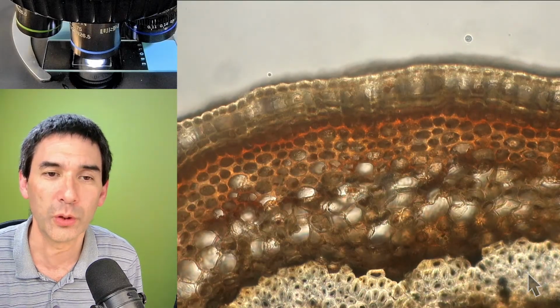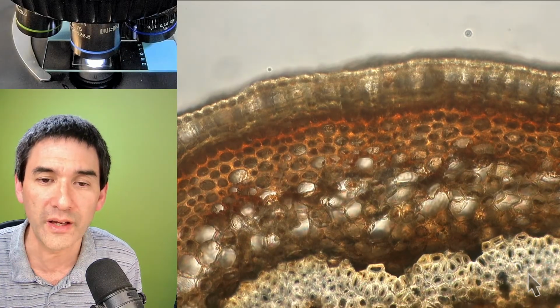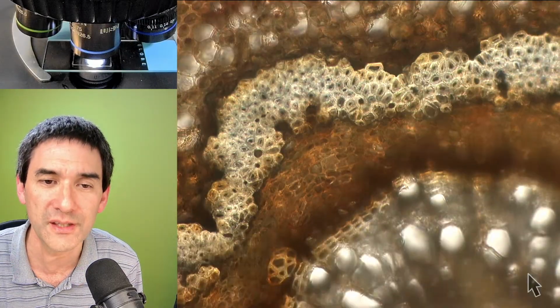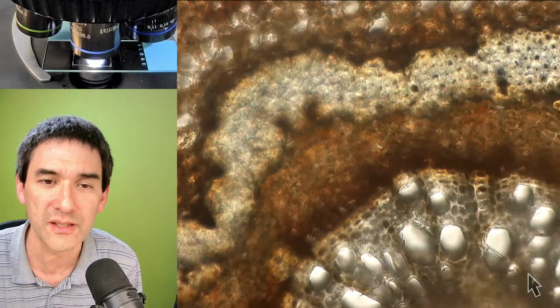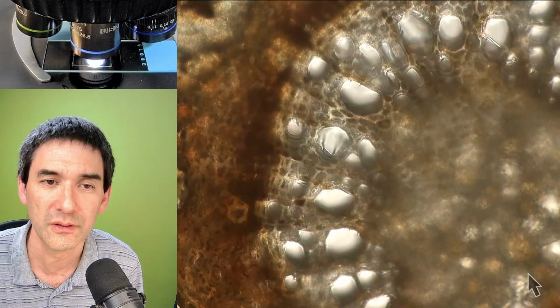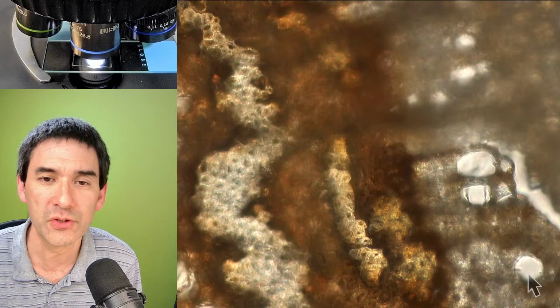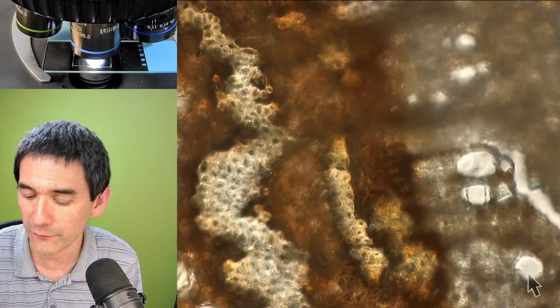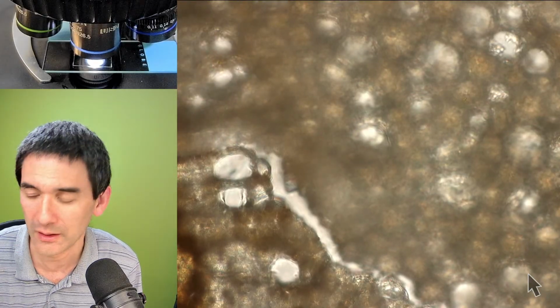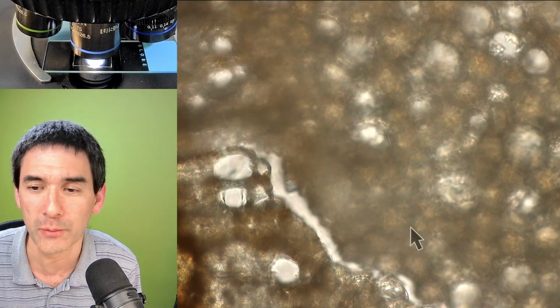After all, we're talking about wood here, which has very thick, strengthened cell walls. But one of the things I find interesting is that even though it is not stained, you still see the different colors. So if I'm somehow able to get a very uniform cross section, maybe one without any cracks, like over here, then it would be a nice way to make permanent slides.